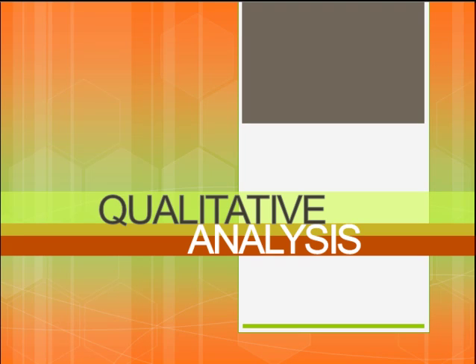Okay, so let's get this started. Welcome to our video report on Experiment 8A Qualitative Analysis.